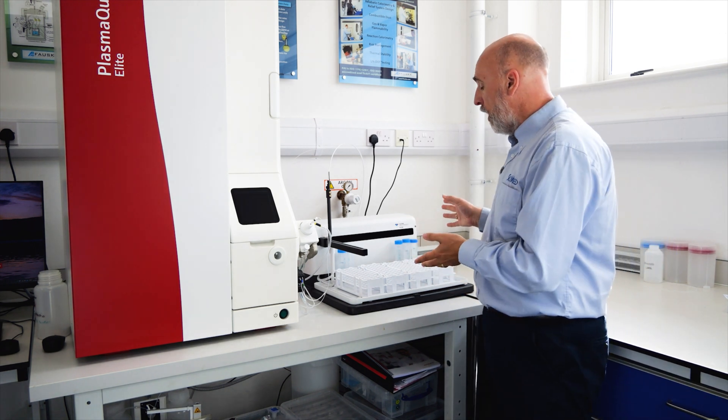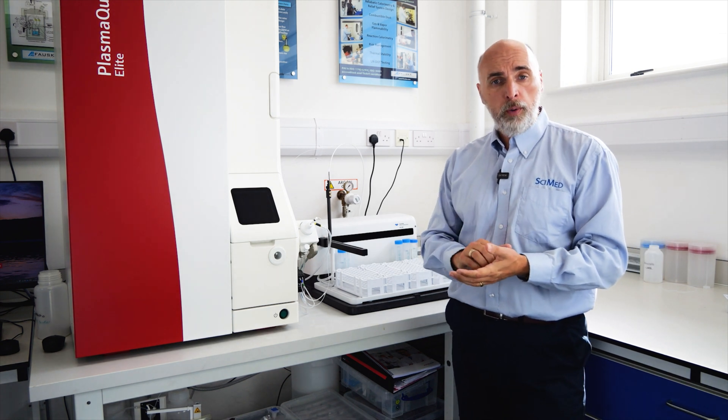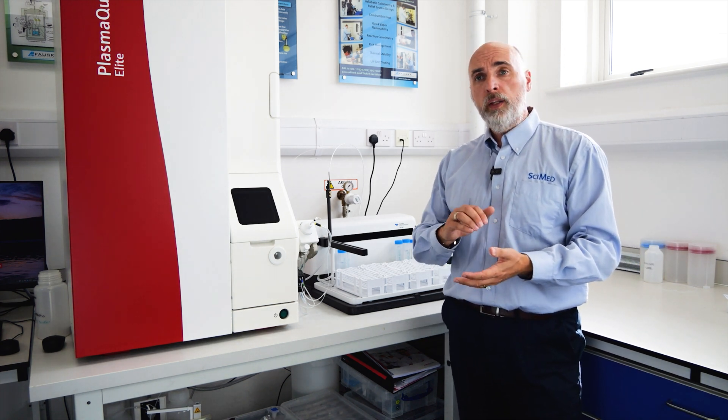We work with both ESI and Teledyne SeaTac in terms of the sample introduction auto samplers. We can have HPLC or ion chromatography systems for speciation, we can do laser ablation incredibly well on this system, and we have software modules for single particle and nanoparticle work as well.